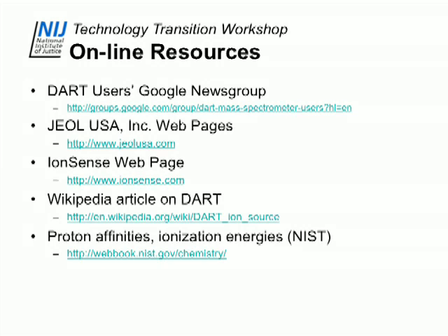It is Wikipedia. So far, it's maintained its integrity pretty well. Nobody's really tampered with it very much, so I think it's a pretty good resource. And finally, we talk about proton attachment and ionization and things like that.